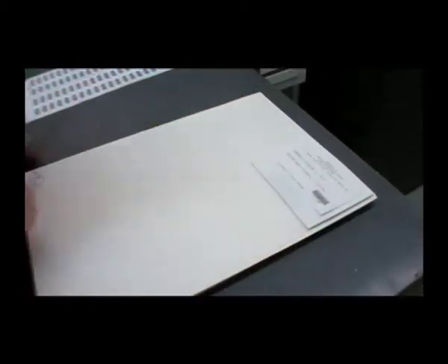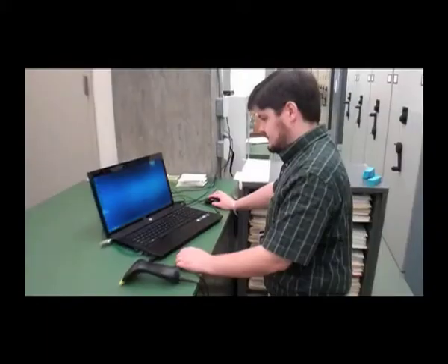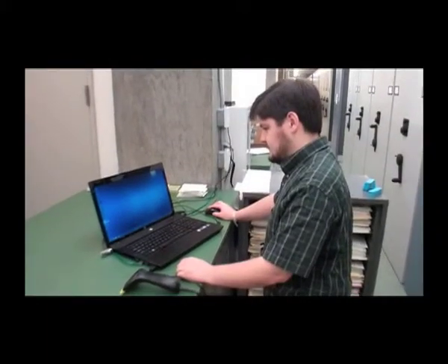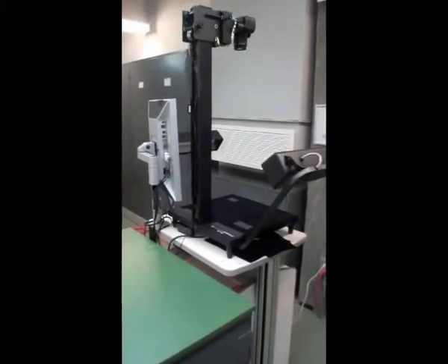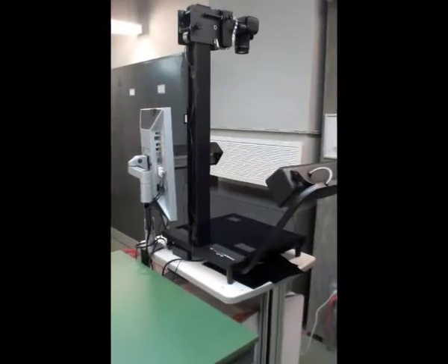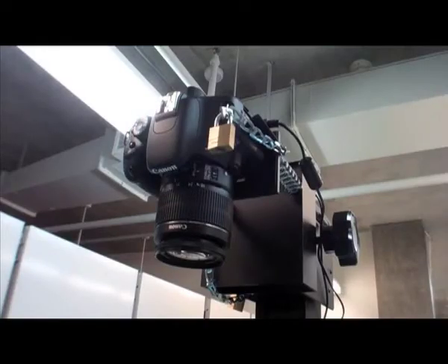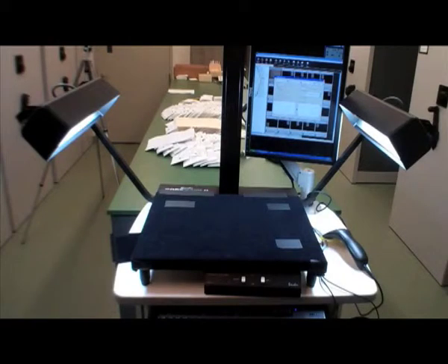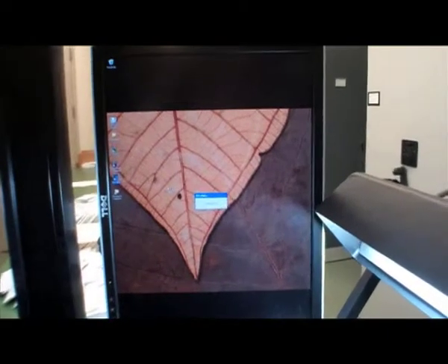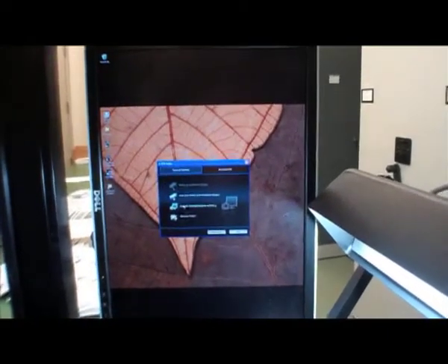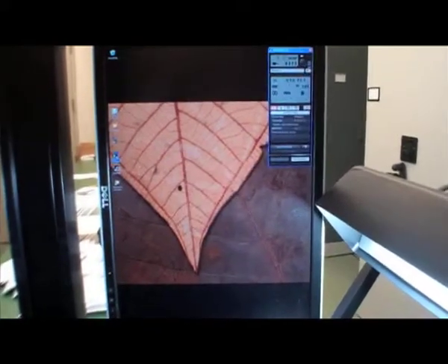Imaging of the labels proceeds after specimens have been barcoded, annotated, and have had their current taxonomic determinations databased. At this time, stacks of specimens are taken by the imager to a specialized digital photography rig. Our setup consists of a downward-facing Canon EOS Rebel digital camera, mounted on an adventure tabletop copy stand with attached fluorescent lights. The camera is linked to a nearby computer terminal, and is remotely operated using Canon digital photo software.